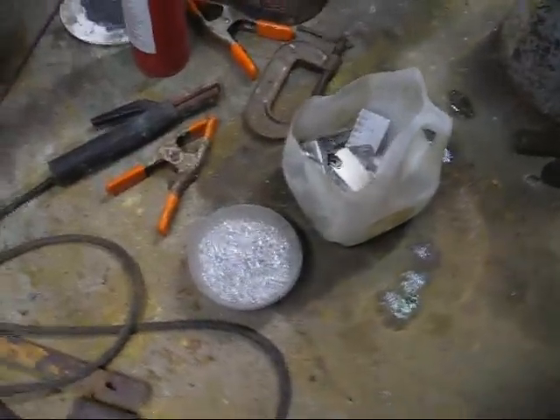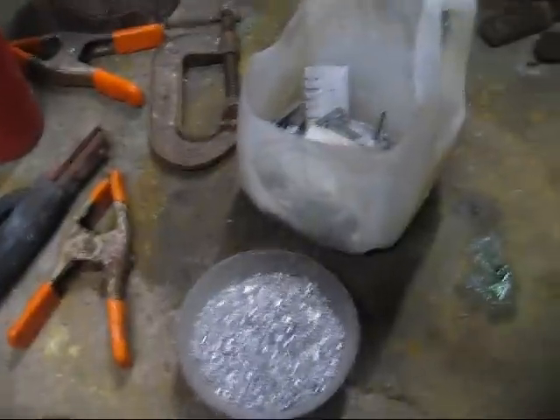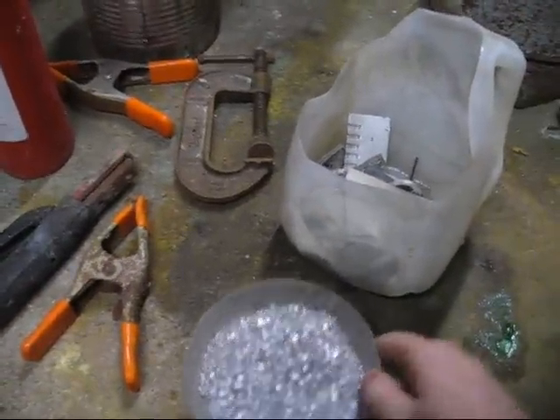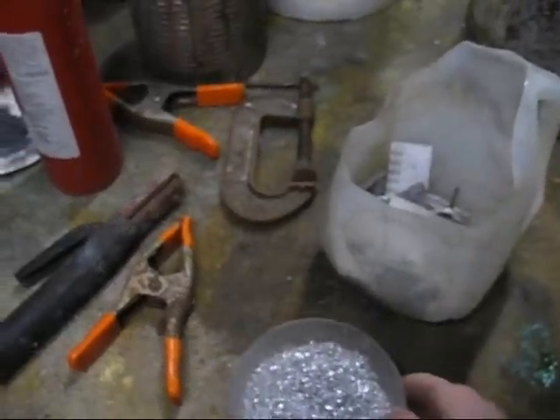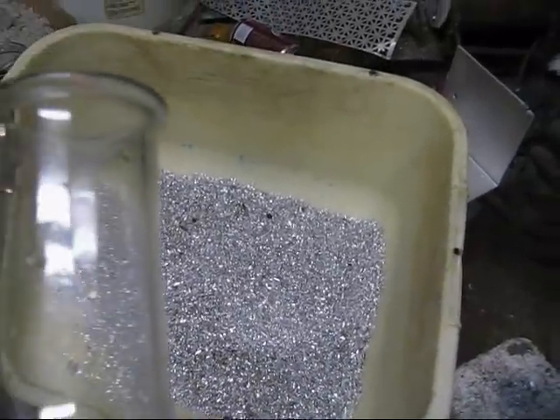Now, for your amusement, I have here a jug with some assorted aluminum cuttings, and I have aluminum chips. This is going to be messy. And now I'm going to make one hell of a mess.